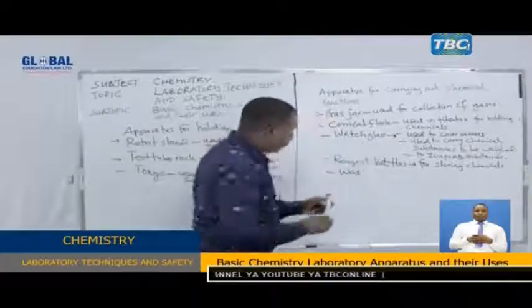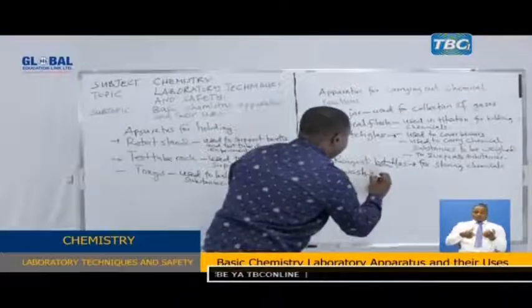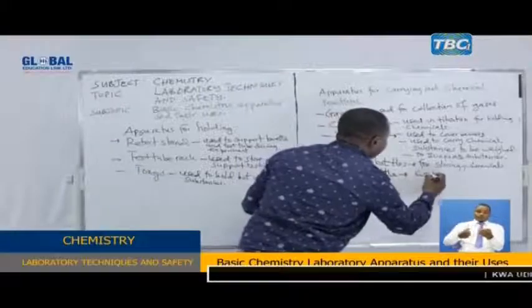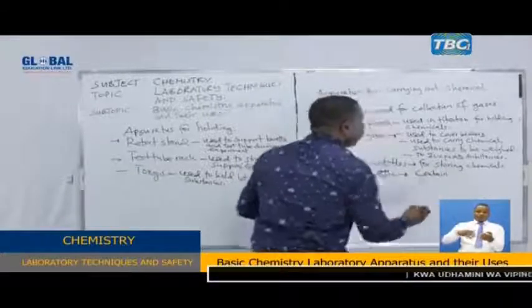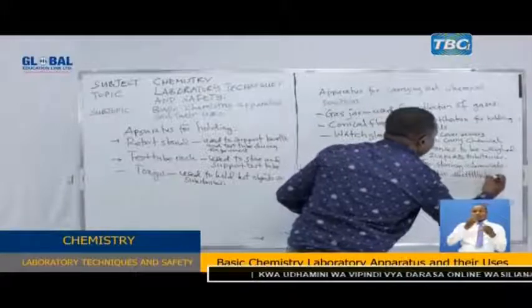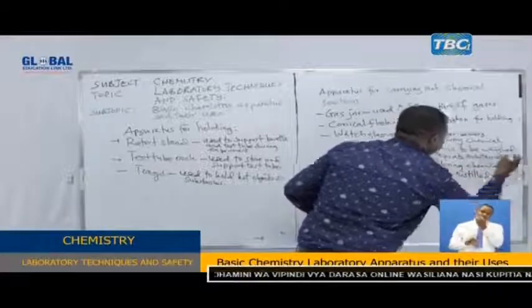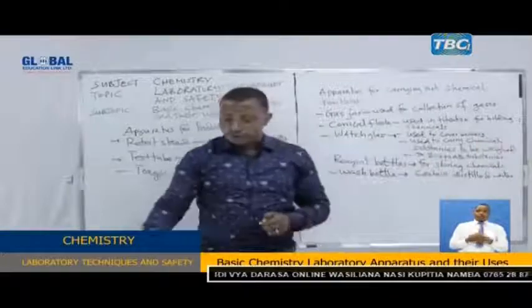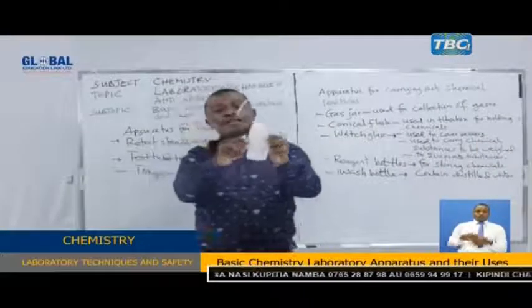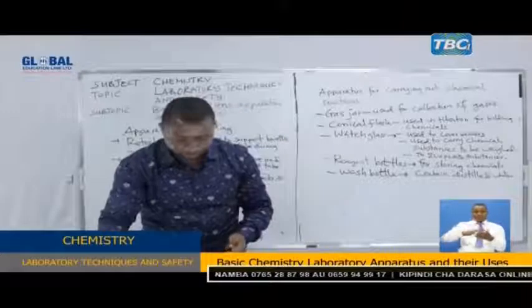We also have a wash bottle. It contains or carries distilled water. The wash bottle is this one here. This carries distilled water that is used for chemical reactions.